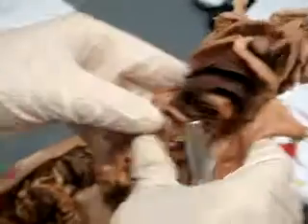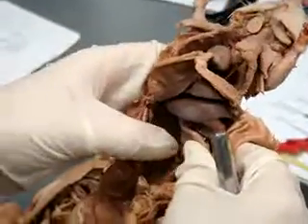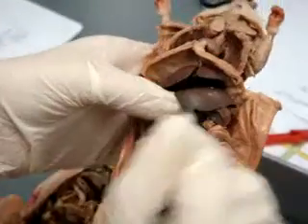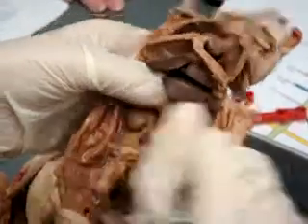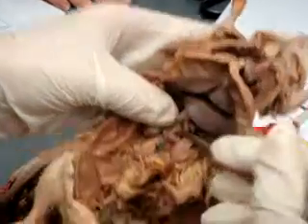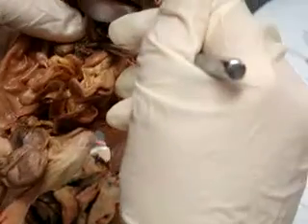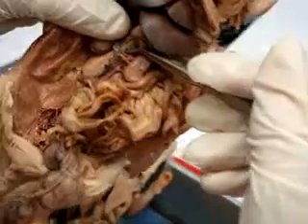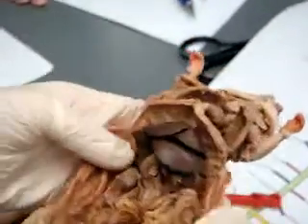So then we come down and we go over to this side because it shows you that one first. You have your right renal artery. Right there. We did this on last Tuesday. You guys all see that? So it's going directly to the kidney.